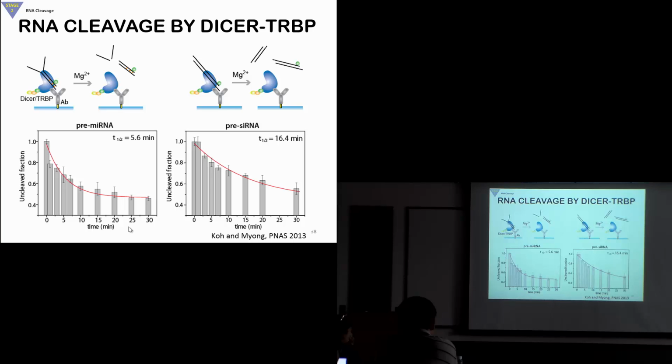So we typically look at the intensity profile first of the donor, acceptor and FRET, and then visit the individual molecules. We also carry out ensemble measurements always on the side, to cross compare, in case single molecule introduces any artifact. Yes, we want to use it. We just haven't made progress in that direction, but of course it would be ideal.